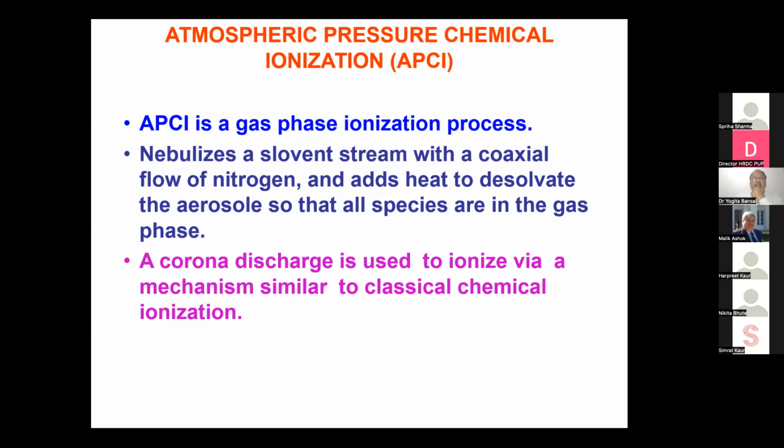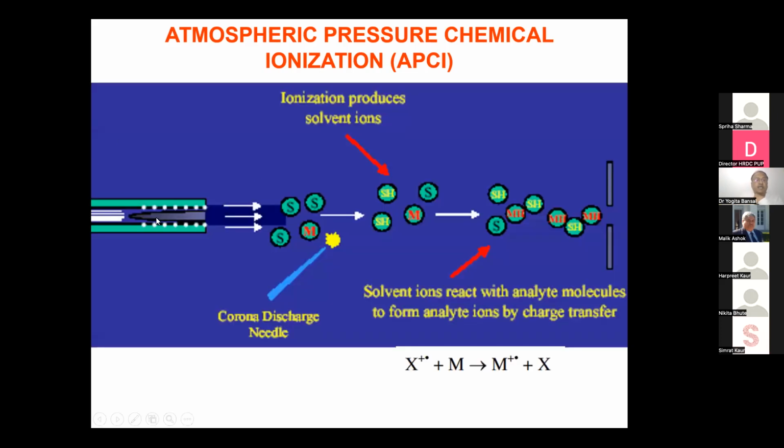APCI is a gas phase ionization process, again gas phase only. Here, it nebulizes the solvent stream with a coaxial flow of nitrogen and adds heat to desolvate the aerosol so that all species are in the gas phase. This is how it is done. See here, we are not using any reagent gas, and we are not using gas phase ions.